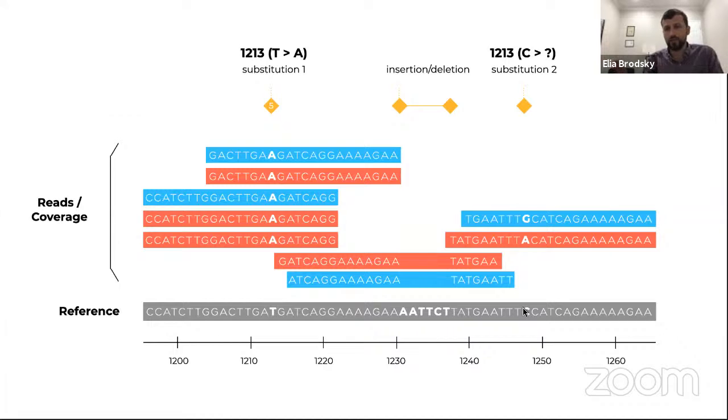If we have a lot of similarity, that means that it is the same virus. It's just developing new adaptations. If we see a lot of these, and I'll give you several examples in just a second, we can say that maybe it's a completely new virus. So we'll talk about that in just a second.